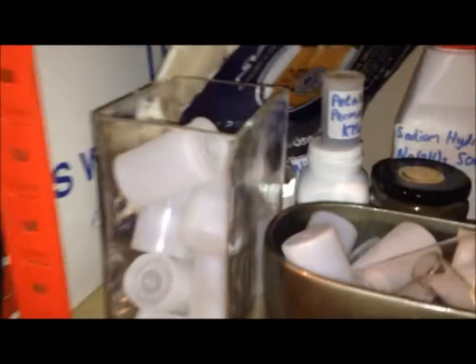Plenty of corks, spatulas, syringes — a lot of them. Here's my biggest syringe, which is actually a lot better than the orange one in the cup. Test tube rack for test tubes over there, along with the film canisters.